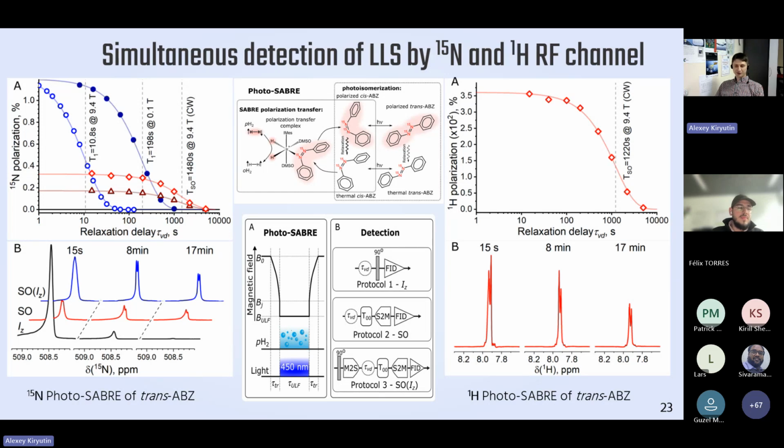But this can be solved by pre-moisturing, so to say: in the gas phase you can add vapors of your solvent, and then you can bubble for several days. For some systems it's reproducible, for some, of course, not. But as I remember, since I did CIDNP, it's a really fast degrading system. Usually you cannot do one hour of illumination. It will deplete it.